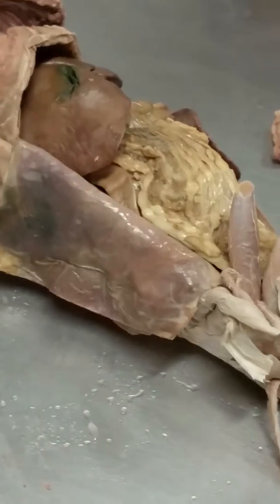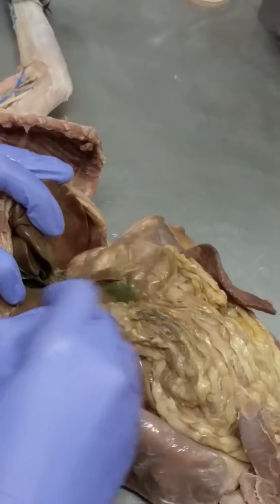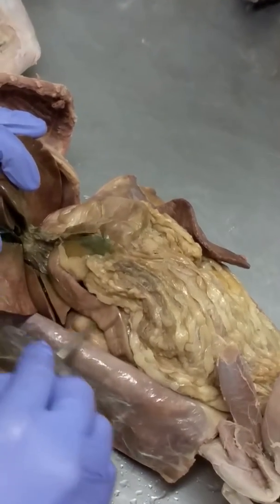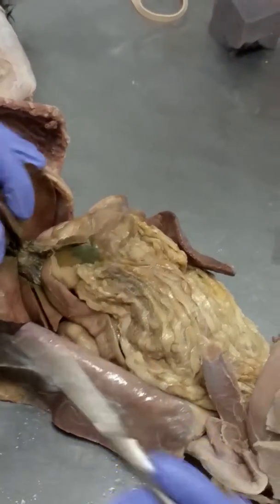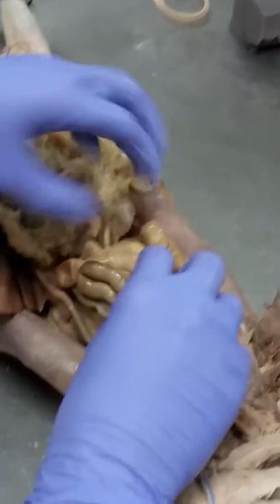Turn this around so you guys can see this. So this is all stomach right here. And then the stomach curves up, and then right there, this is duodenum going down. There's duodenum. Okay. So duodenum is the first part of our small intestines.